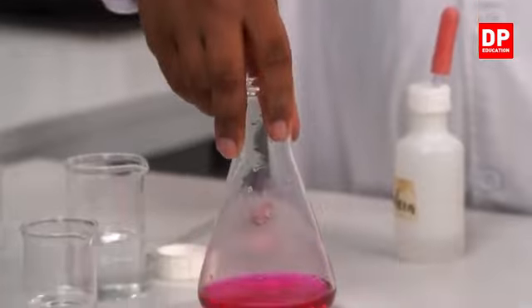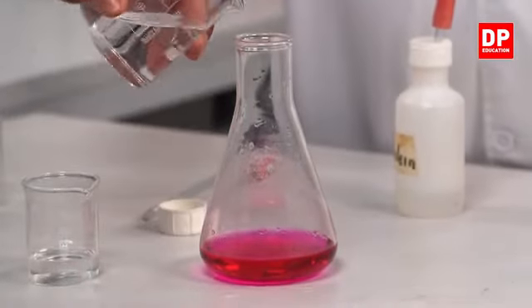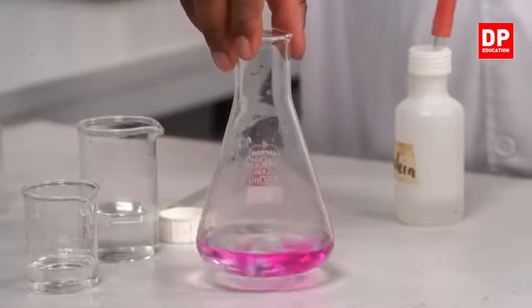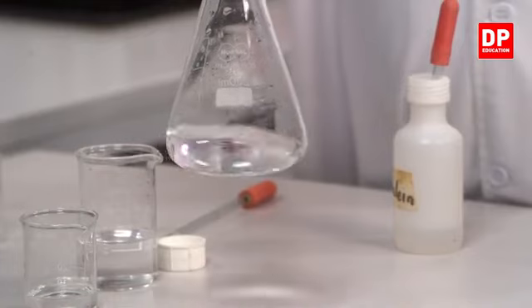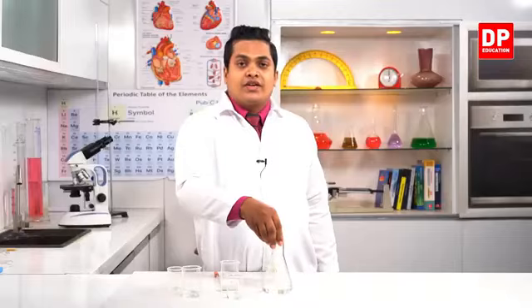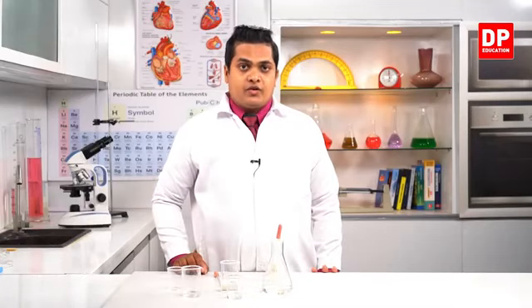See, so when I add this hydrochloric acid once again, it will turn into a colorless solution. So we can say that when you are reacting or mixing an acid with a base, both the acidic and basic features disappear to make neutral substances. So children, we will head to the classroom and write down our observations and our conclusions from this experiment.